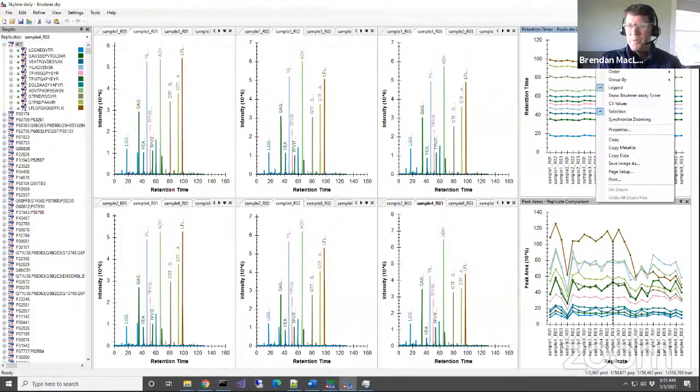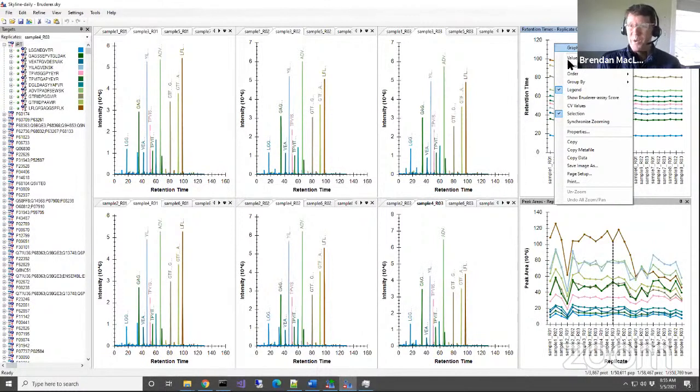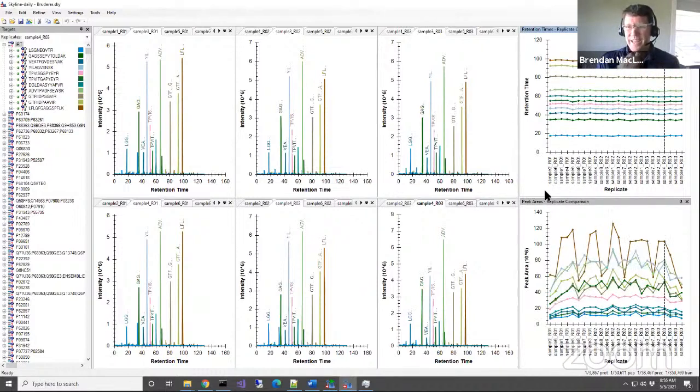Blocking. So we hope that they did blocking. If you don't know what that means, well, they actually did do blocking. And they did randomization. So this is a really nice data set. But I've done this order by acquired time with other data sets and gone, oh, they didn't do randomization. It's completely in this very specific order. So let's go back to order by acquired time. I think Olga might have been a reviewer on this paper and insisted that they go back and do randomization. But yeah, you can see that they did blocking.